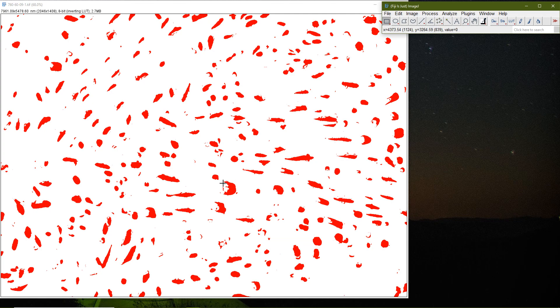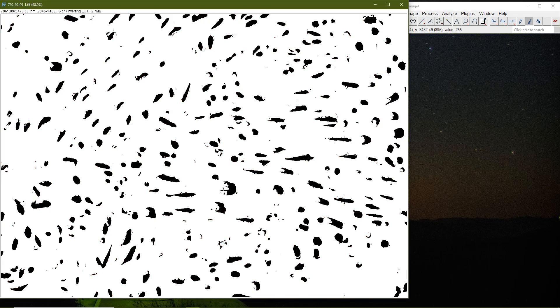Now I know this was a complete particle, this one is missing a piece, this was a complete particle, this is missing, and these here may not be particles at all and I want to remove them. To adjust these features I'll use the paint tool.